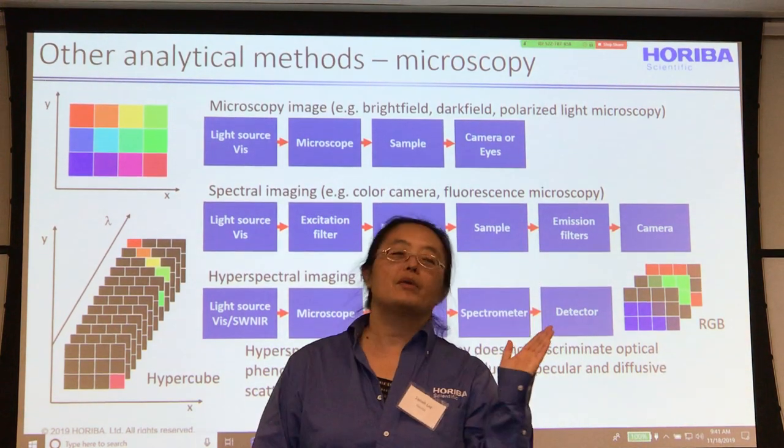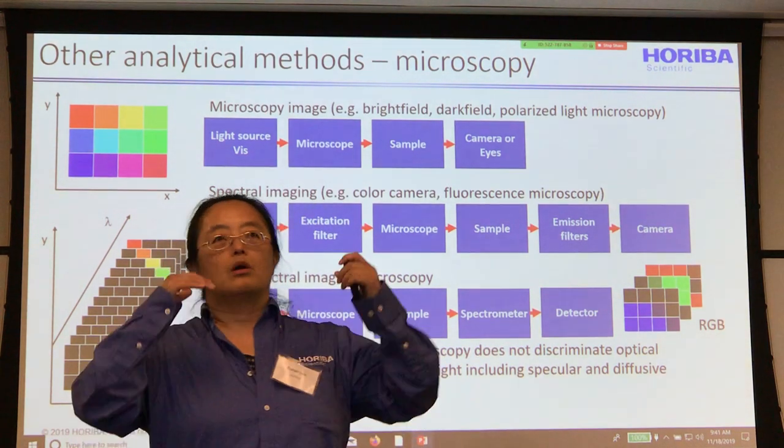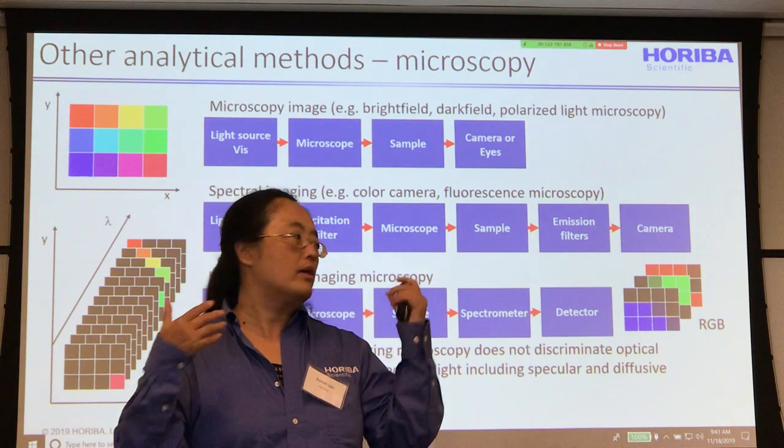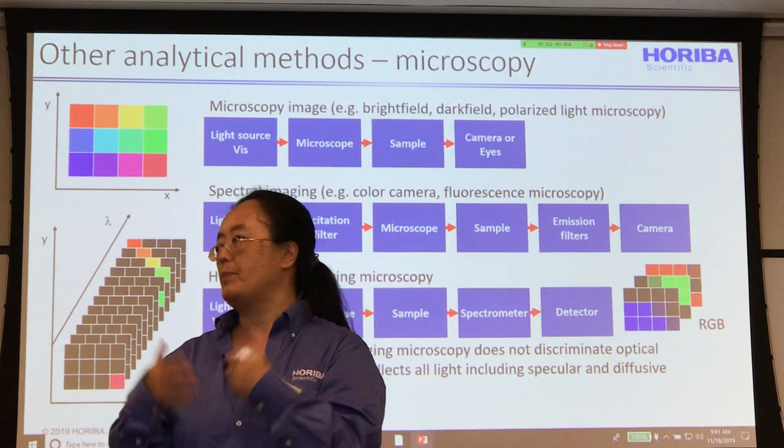And then there is something called epifluorescence. So it's the same thing, but more, I'd say, better developed because it's developed by microscopy people.